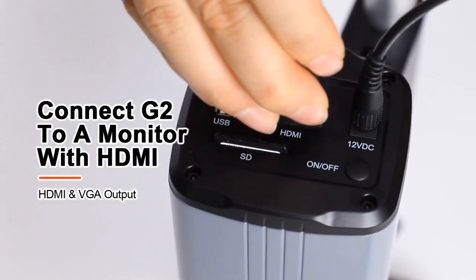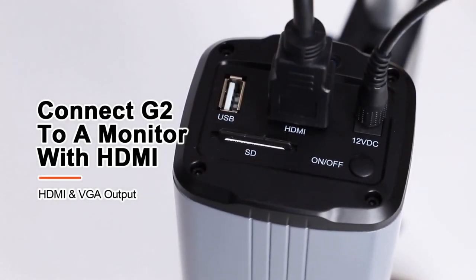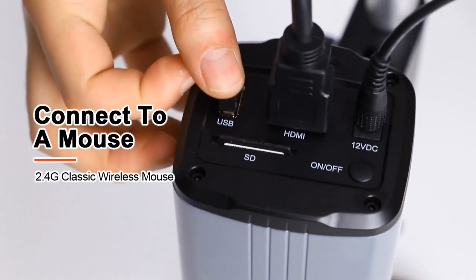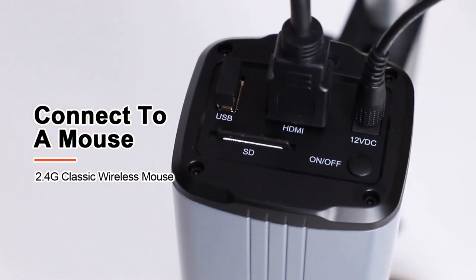Next, connect G2 to a monitor with an HDMI cable and connect the wireless mouse to the USB port. Finally, press the power on/off button to start up the camera.